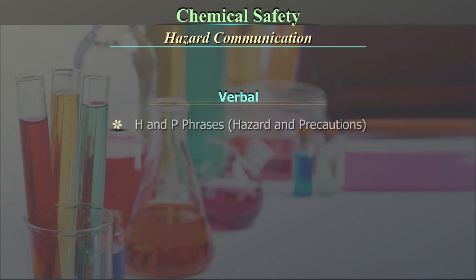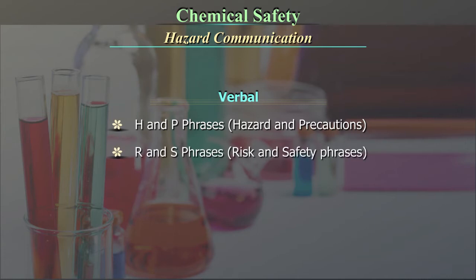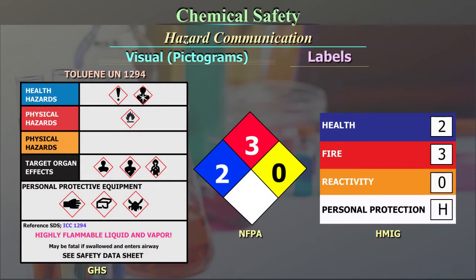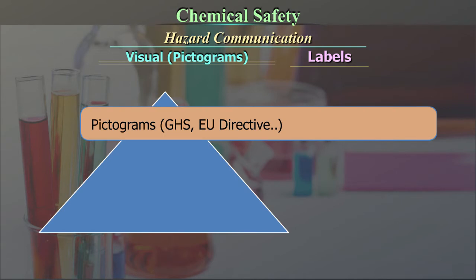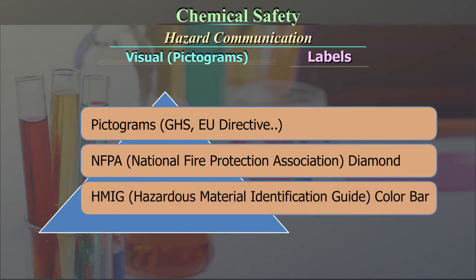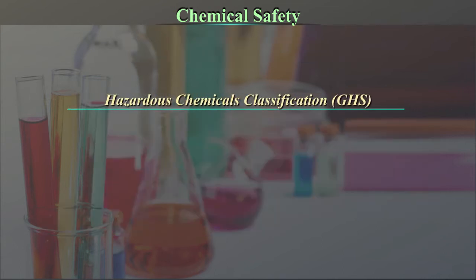Verbal communication includes H and P phrases (hazard and precautions), R and S phrases (risk and safety phrases), and MSDS or SDS — Material Safety Data Sheets. The visual hazard communications are of three kinds: labels, pictograms, and systems such as GHS, EU Directive, NFPA (National Fire Protection Association) Diamond, and HMIG (Hazardous Material Identification Guide) Color Bar.